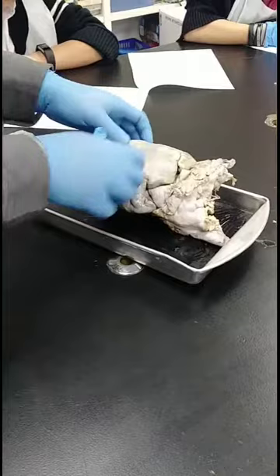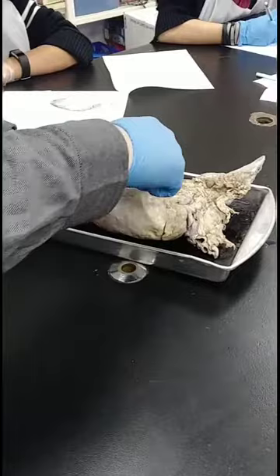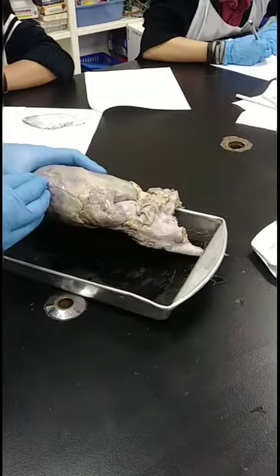On the other side, here's that groove marking the posterior. Does everyone see that? Okay. Remember, this is 3D. So the ventricle wraps all the way around the heart, right? So draw and describe that.